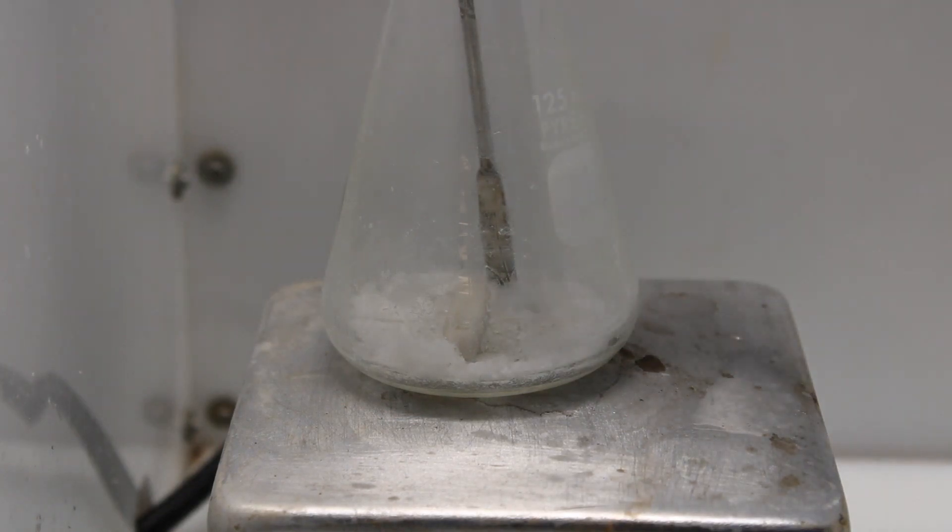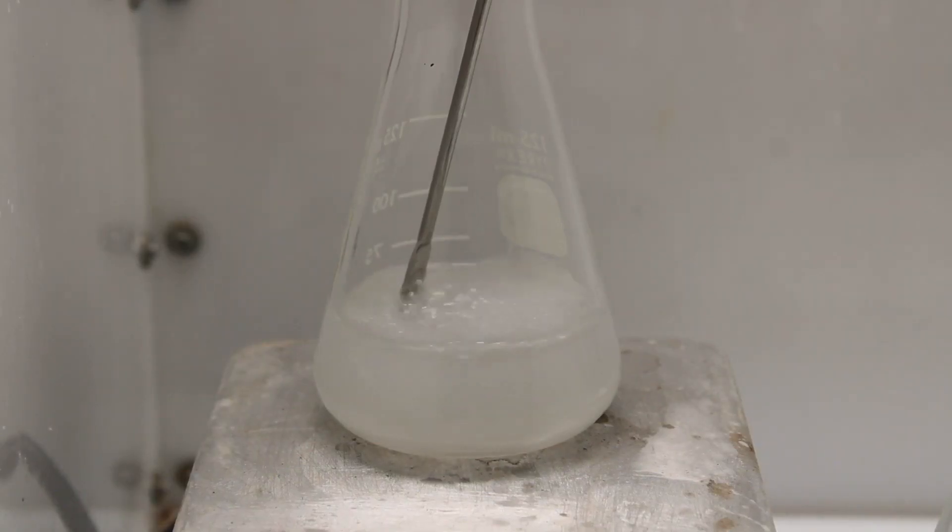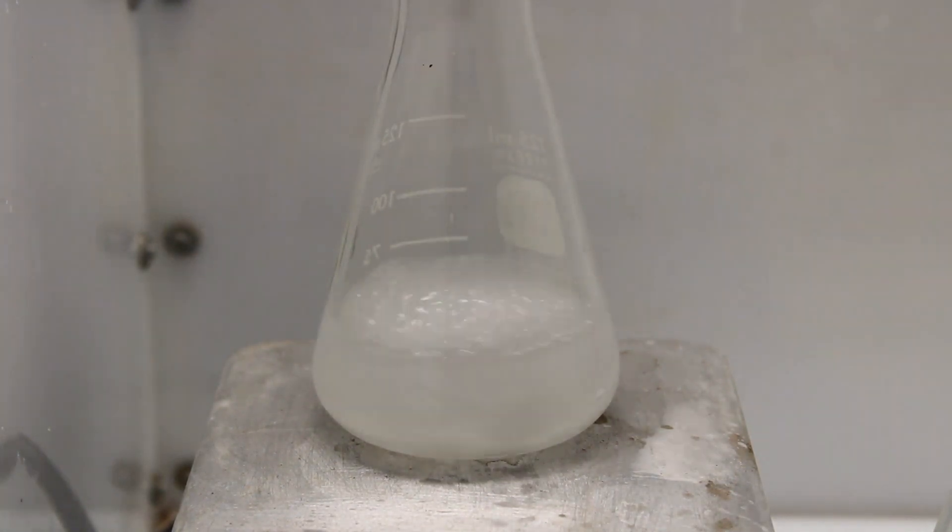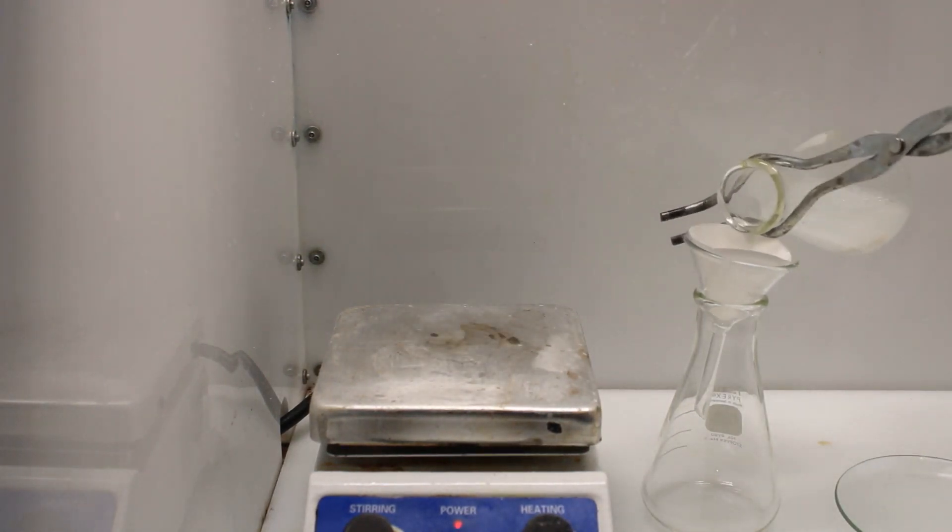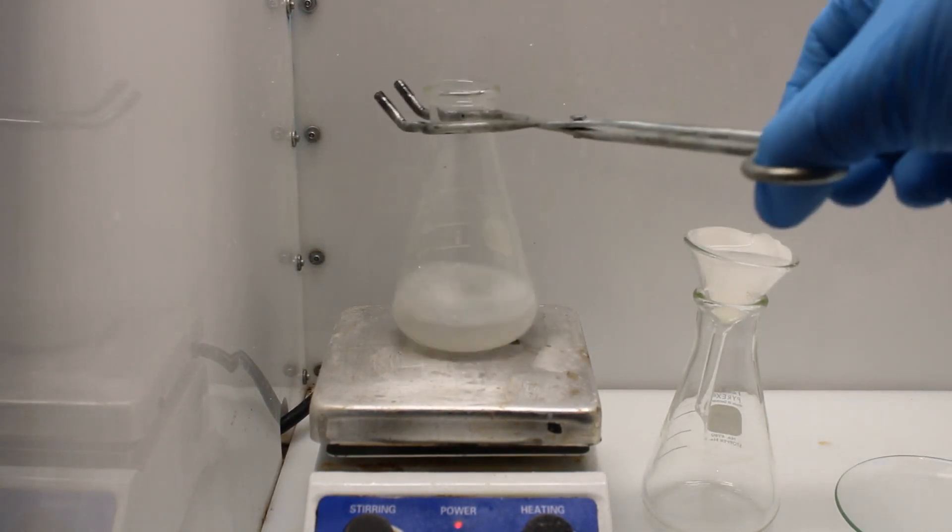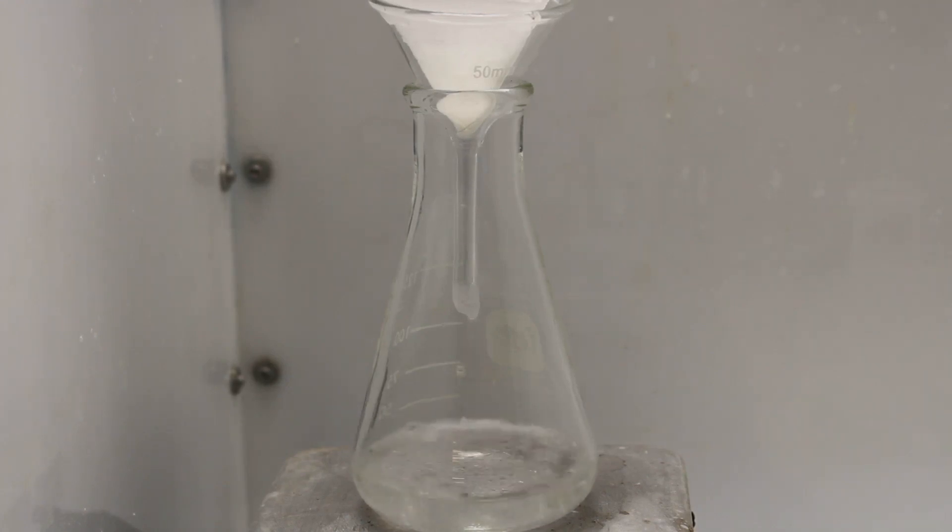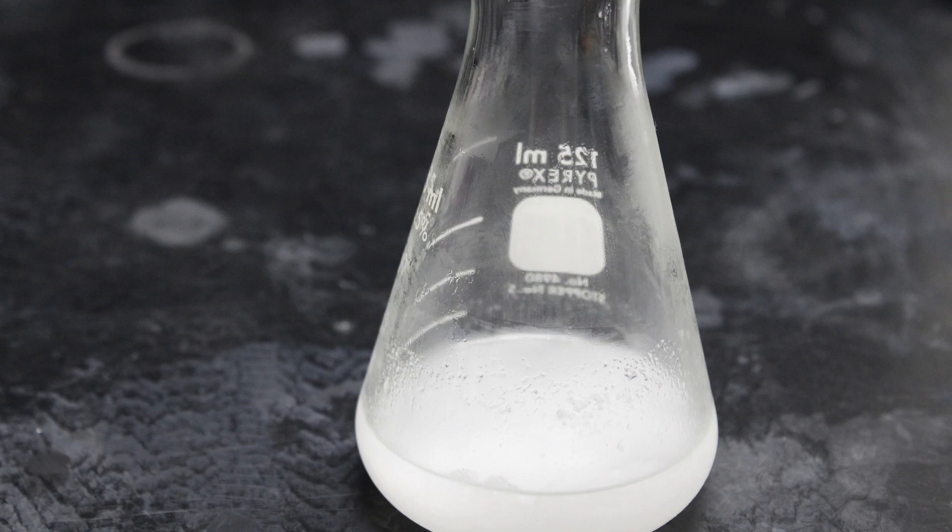The crude urea was dissolved in boiling isopropanol. This took around 60 milliliters. The solution was then filtered and allowed to cool. The flask was then placed in the freezer overnight to precipitate as much product as possible, causing the flask to become filled with crystals.